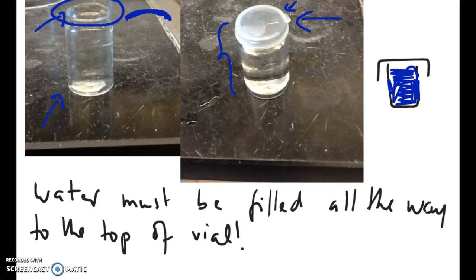Just one note about this experiment. It's crucial that you fill that water all the way to the top, because remember, our assumption is the volume of the water is the same as the volume of the vial. So if you have a bunch of space in the vial, then the volume of the water is not equal to the volume of the vial. So it has to be filled all the way to the top, okay?